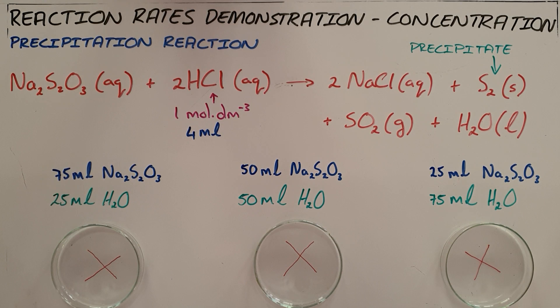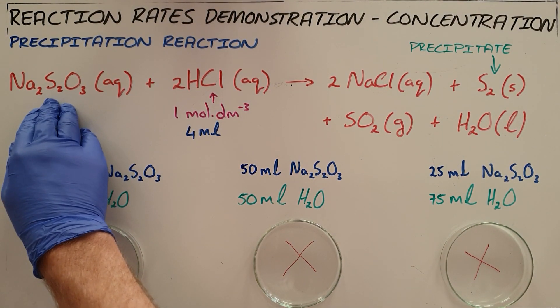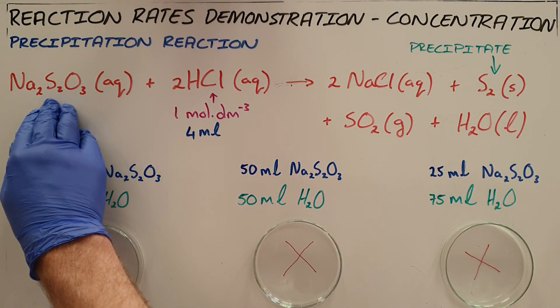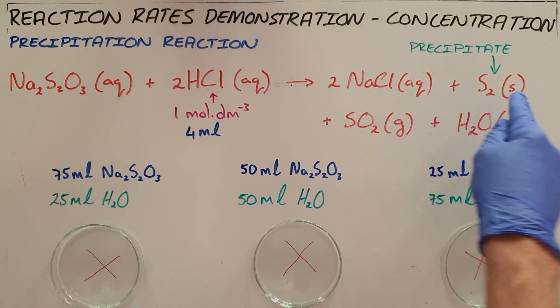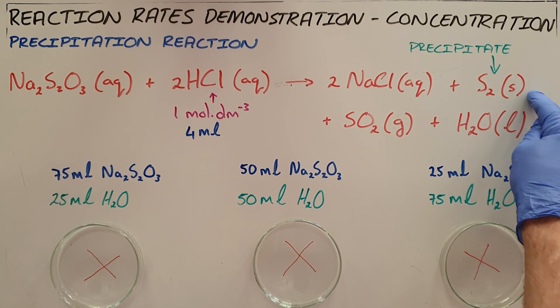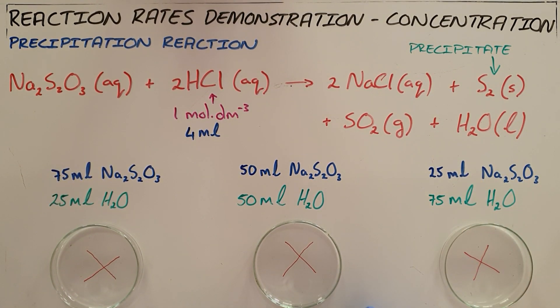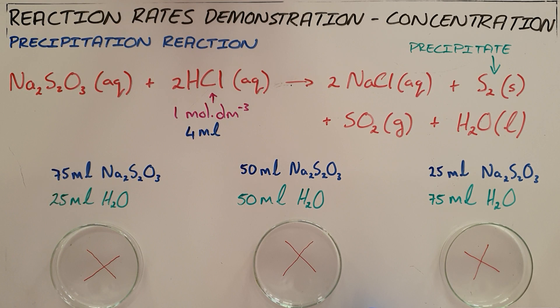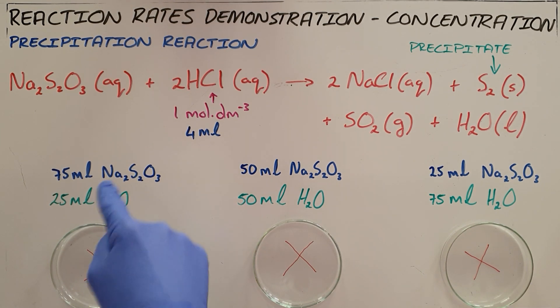So here we have a precipitation reaction occurring between sodium thiosulfate and hydrochloric acid that forms a number of products, but one of them is a solid that forms a white powder — a precipitate that drops to the bottom of the petri dish. As a result, we'll see the X's marked on these petri dishes disappearing.